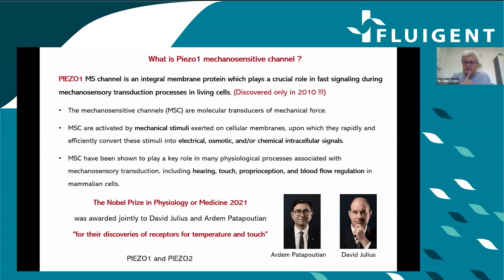One interesting characteristic about Piezo1 in red blood cells is that it is the only mechanosensitive channel there. So we have the chance to study the properties of Piezo1 really on its own, not together with other families of mechanosensitive channels.